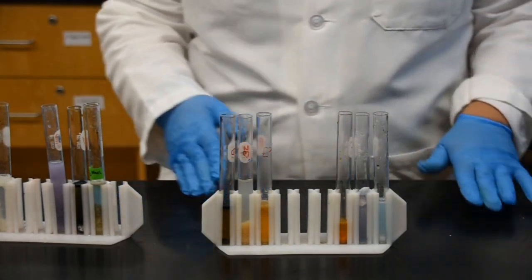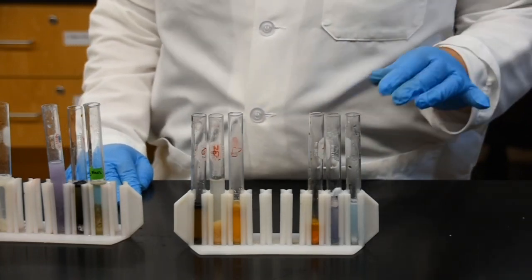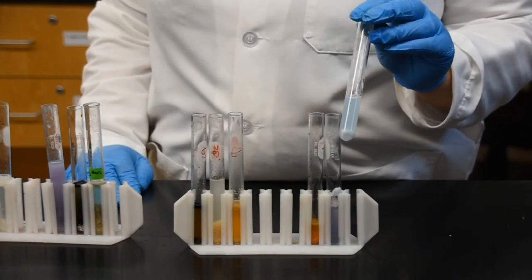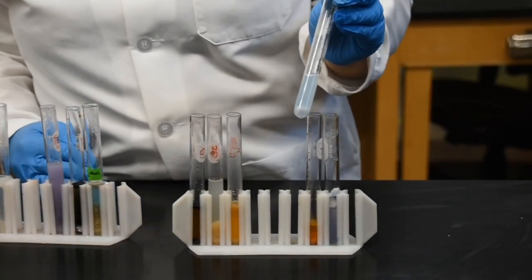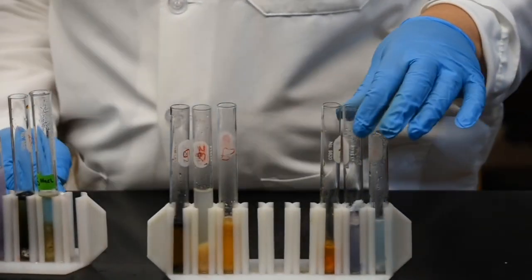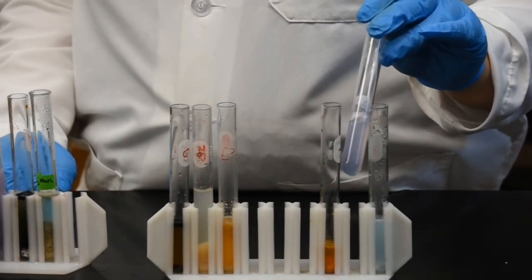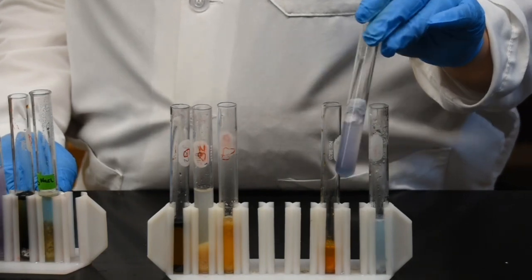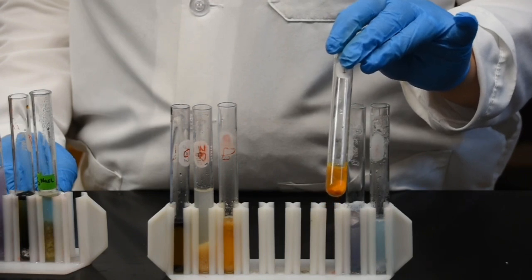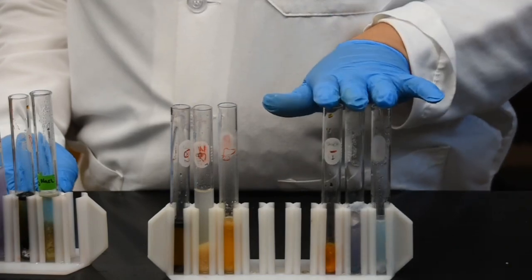So what I'm going to start with is our first food sample we have right here, which is our egg sample. So again, the first tube right here I have is for the Benedict sample, which is again testing for simple sugar. Notice for the egg, the sample of the Benedict stayed blue color, which means there was no reaction. Second tube for the egg, we tested for proteins, and as you can see, the color has turned purple. Third tube tests for starch using your Lugol iodine, and you can see the color is yellow. So that's your first food sample.